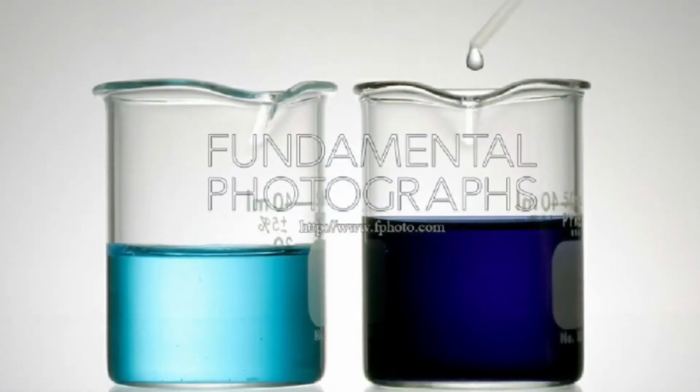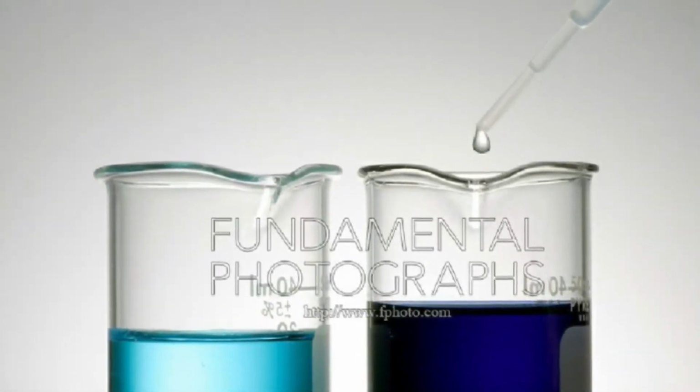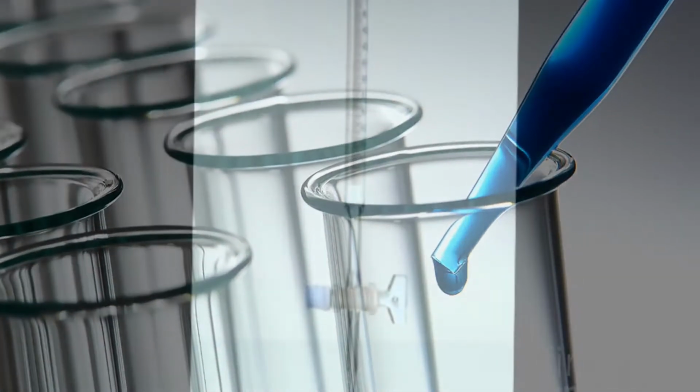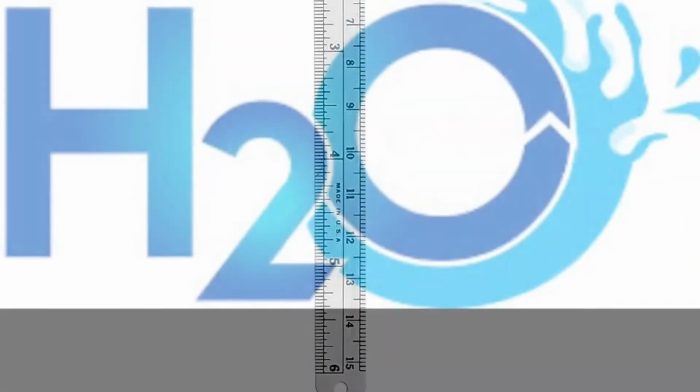The materials used in this lab were the aqueous solutions of potassium hydroxide and copper sulfate. There are also 8 test tubes, a burette, spatula, metric ruler, and water.